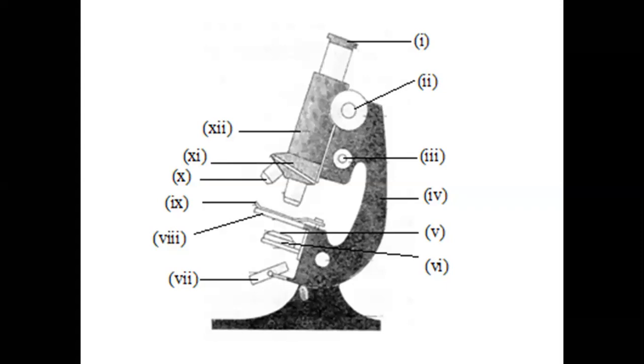So in case you start with a microscope whose, number one, the lenses are not aligned, especially the objective lens has not clicked in place. Number two, the diaphragm is closed. Number three, the mirror is not reflecting anything. Those are the very key areas that most students go wrong. And if you pay attention to those main areas, you always have an easy time. But anyway, as we move on, that is something that we can always work on.